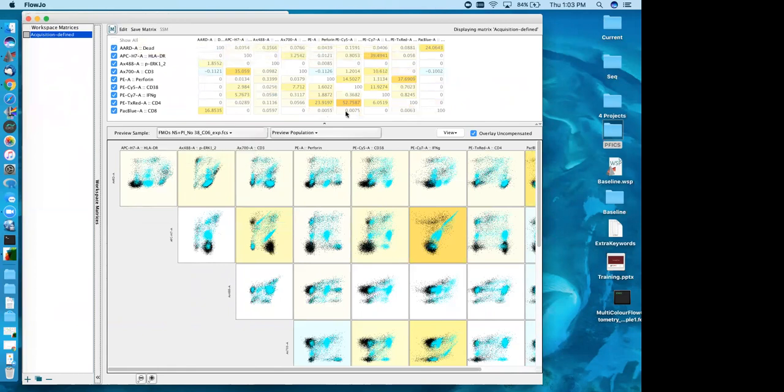All right. At the top, you see the actual spillover numbers from the matrix itself, and they're heat mapped. So the darker the color, the more spillover there was between parameters. So there is no number that is just inherently wrong. All it's displaying is how much signal was detected from the primary fluor and how much was actually spilled over in from another fluor. So even if it's like, say, 100%, it just means you got the same amount of fluorescence from the primary and some secondary fluor.